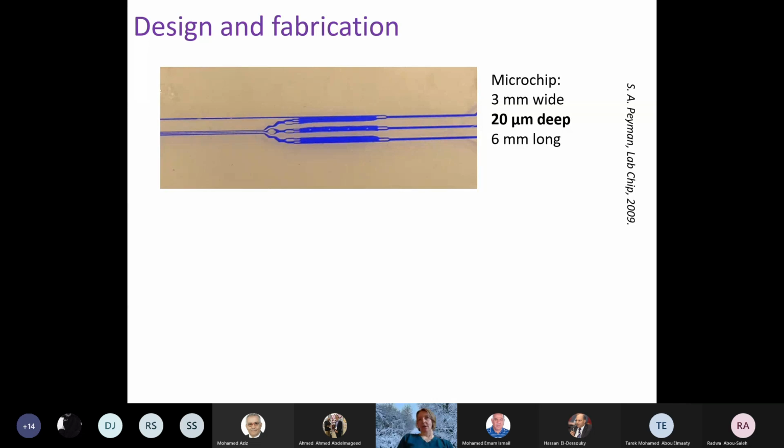Okay. Going back to the idea of diffusion, we do have to consider how quickly molecules diffuse within microfluidic devices, because we want to have control over that mixing. And this is just to really show you how diffusion works in microfluidic devices. So this is a multilaminar flow device. It's got 5 inlets with alternating ink and water. So you can see the layering in that device. It looks like there's no mixing involved in there.